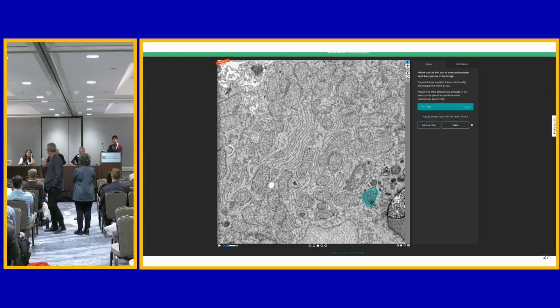I can maybe start in the middle. There are a lot of resources around this. It really depends on the data, how much metadata, and what you want to do with it. Probably the one that people have used the most is the Bioimage Archive. It's a few-year-old effort out of the EBI. They will take all of your data with very little metadata attached to it, which we can have some bar conversations about later on whether that's a good approach or not. There's something called the Cell Painting Gallery, if these are high-content imaging approaches. The curator is sitting right here, the woman who is really the driving effort behind it all, so you can certainly talk to her about it.